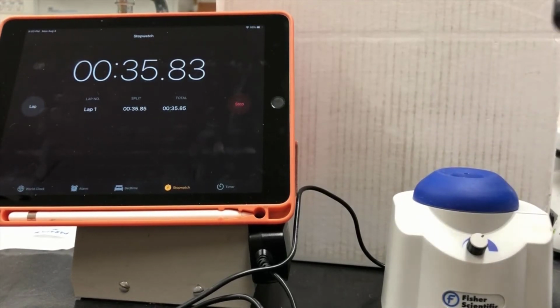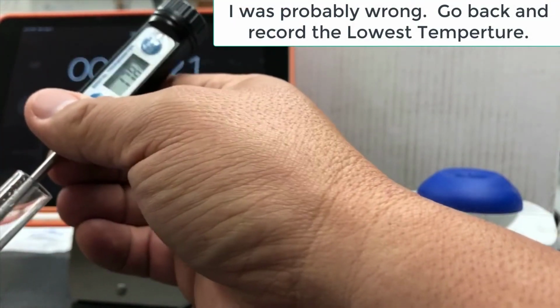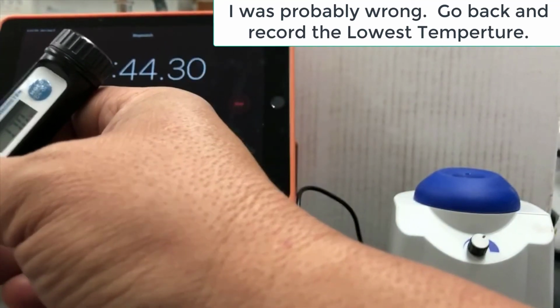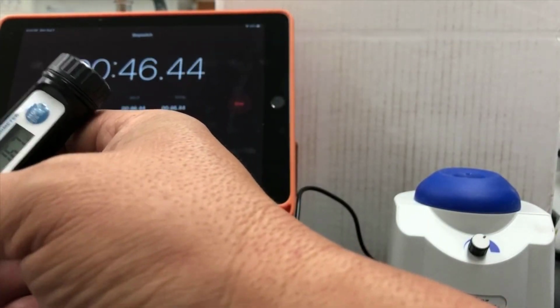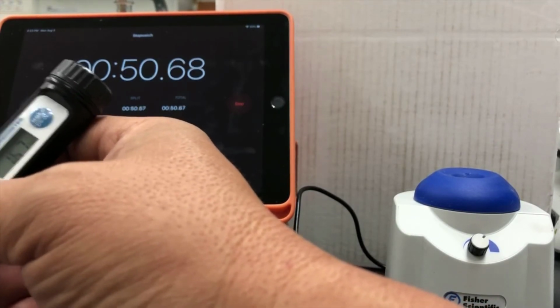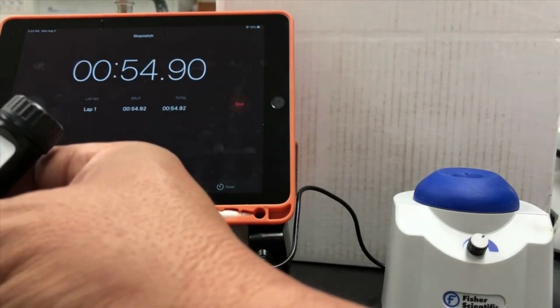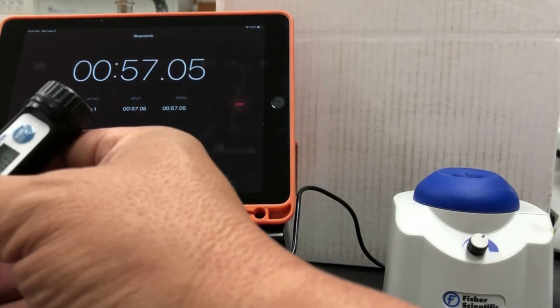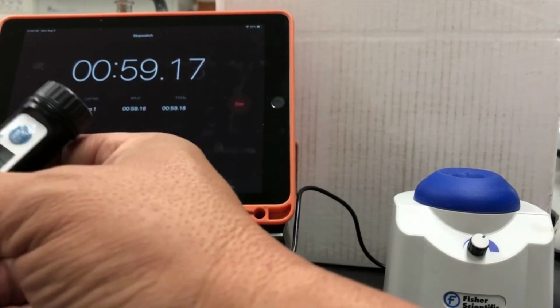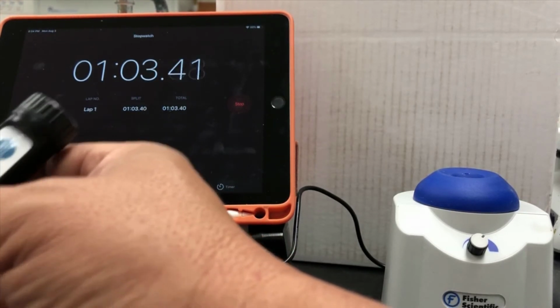And then stopped it, forgot I was going to record the temperature. Let's see what our temperature is. So right around 16.7. I had my fingers on the glass down there below, so I probably warmed it up a little bit. I try to move them up, but it was around 16.7, the lowest, okay?